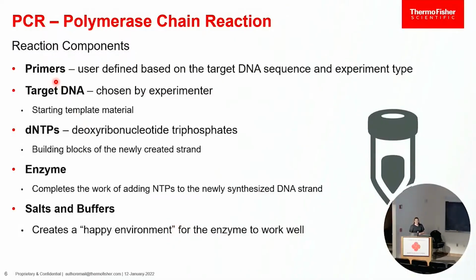Well, PCR has primers, and those are two starters. I've got some pictures for this, but they're little 25 base pair starter molecules. And because we can define where those are and make a specific sequence, we can amplify specific things in our target.